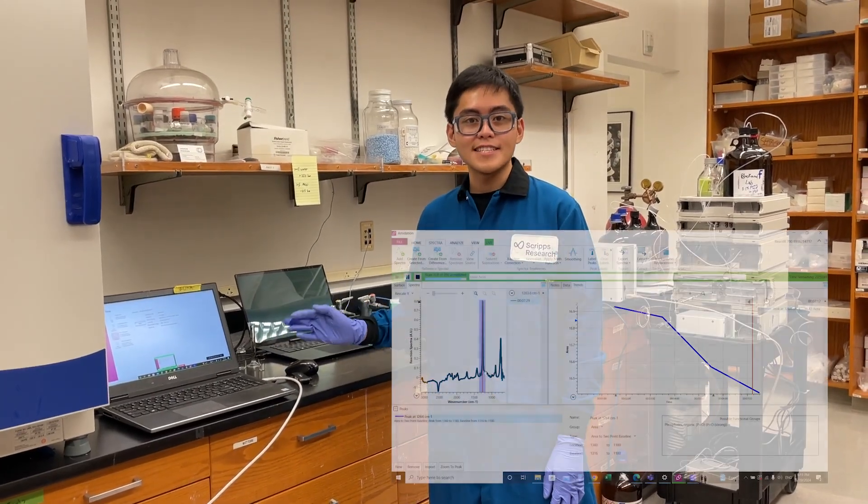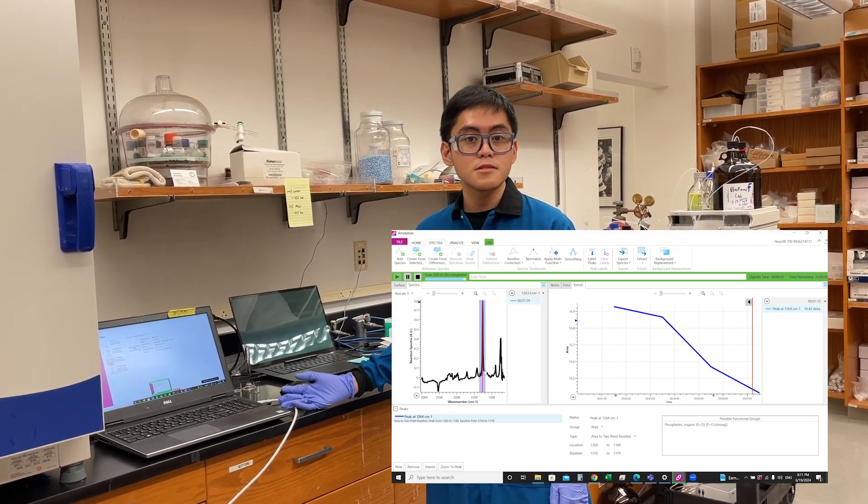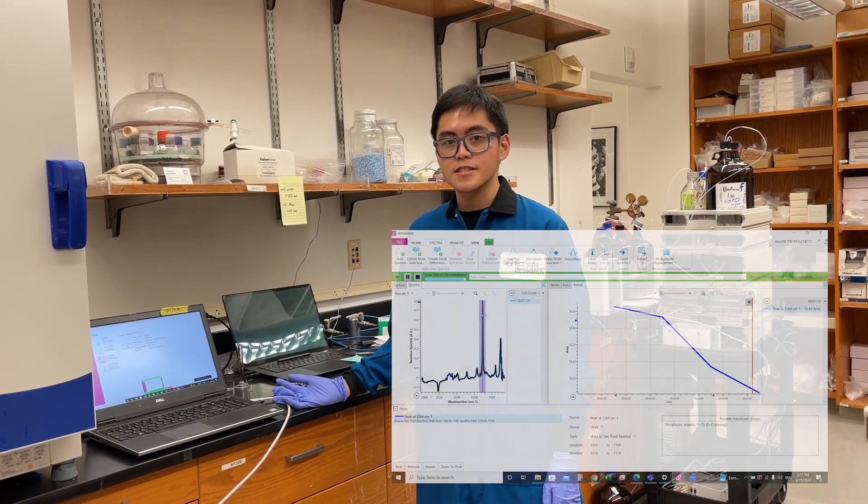Lastly, we have the computer where you can easily visualize the data. It is connected to the spectrometer, which generates a real-time spectrum and shows your reaction progress over time.